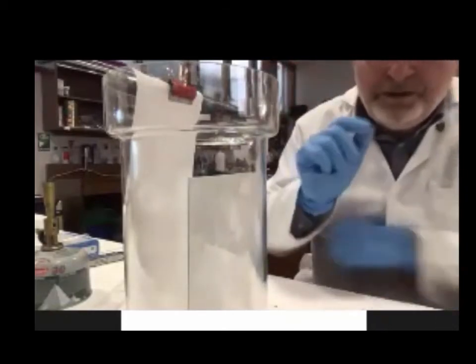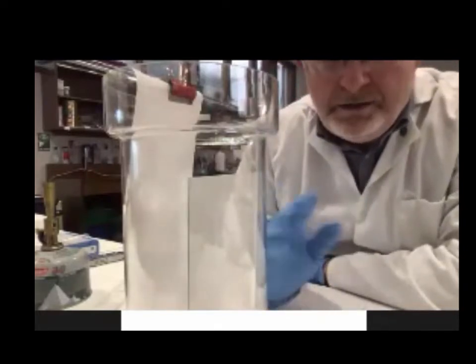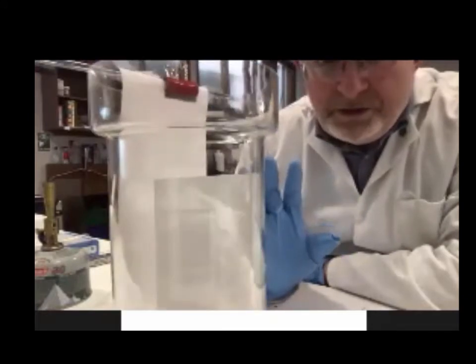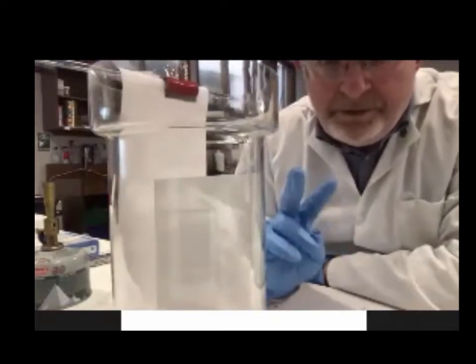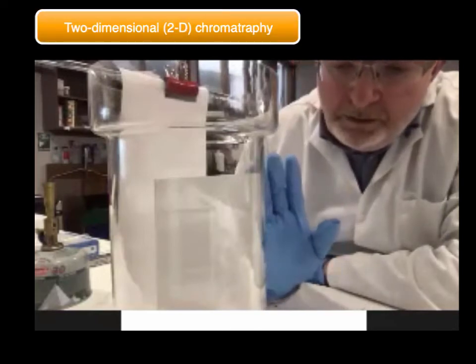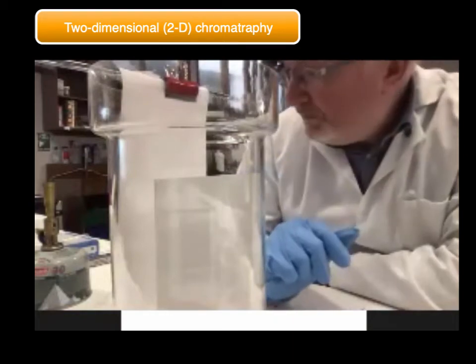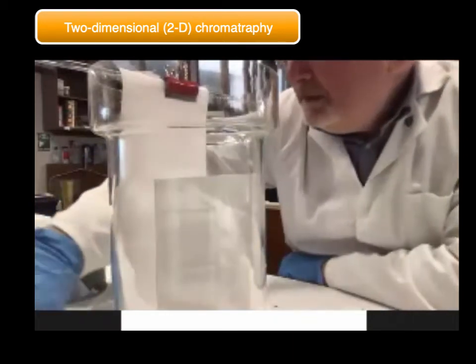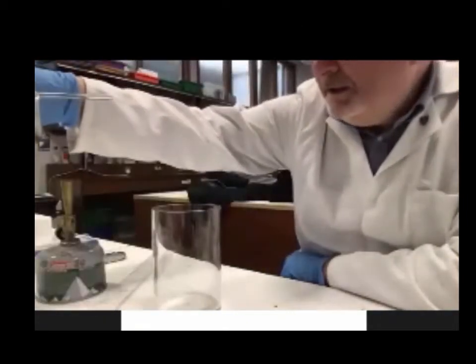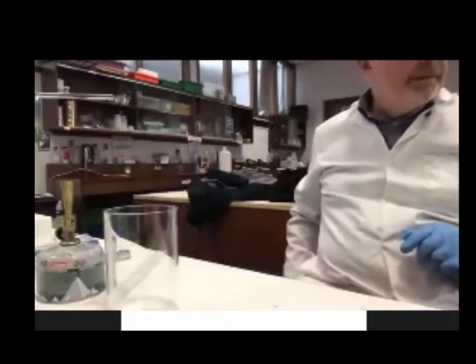With the paper, though, you have an advantage, and the advantage is that in a jar, you can rotate the paper 90 degrees, and you can then separate the pigments in 2 dimensions. When you do that, it's called 2D chromatography. It's a little bit more advanced than just your basic junior cert kind of thing. Okay, we're going to come back to that now.